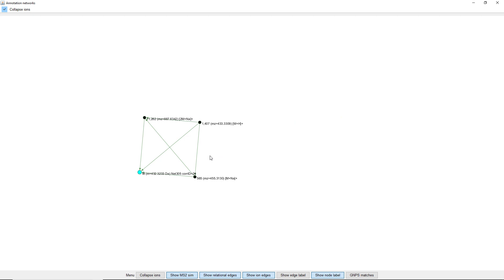Behind one of the cyan dots there's always a whole network. This network consists of M+H, M+sodium, 2M+sodium — a multimer — and we have the network ID. All the black nodes are features and the cyan nodes are neutral molecules, and the neutral molecule mass is basically the identifier. We created this type of network because it reduces redundancy, since all these ions just point to the same neutral molecule.